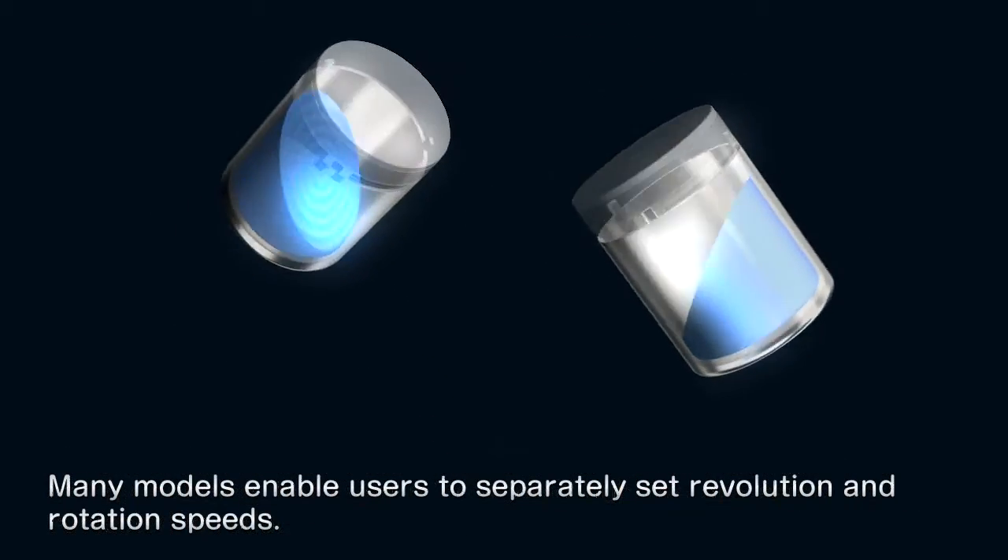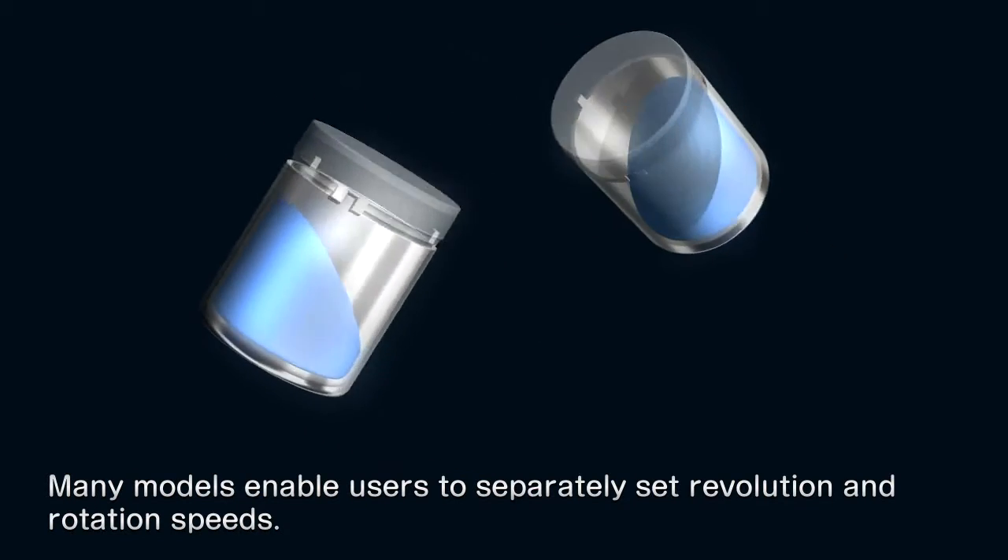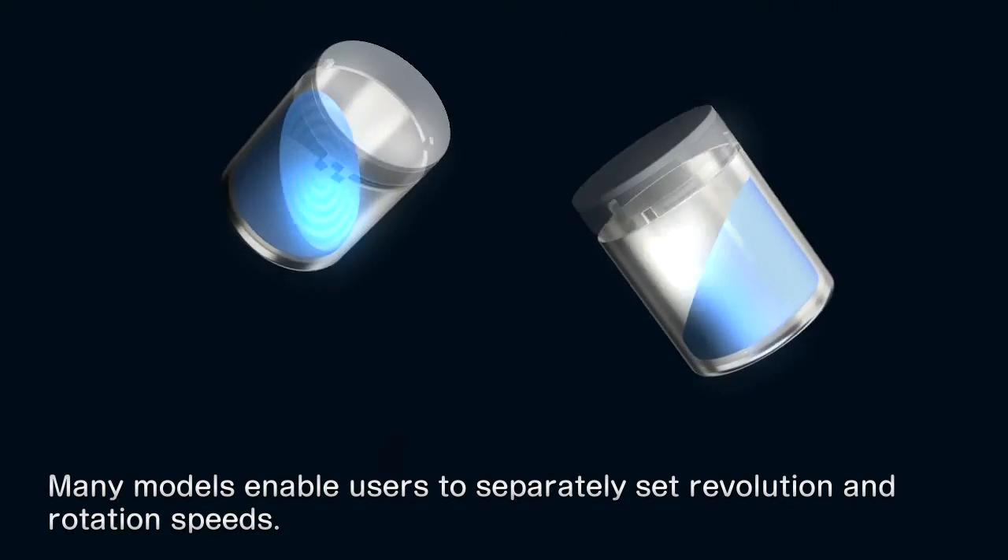Many models of this mixer degasser are designed to allow users to separately set revolution and rotation speeds.